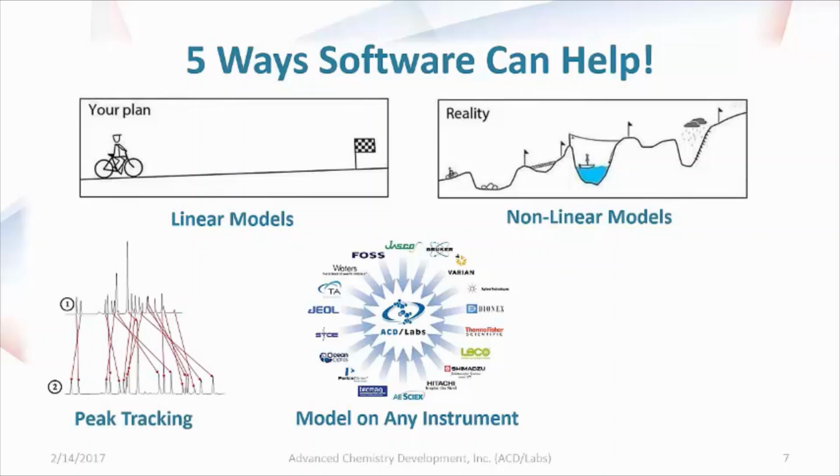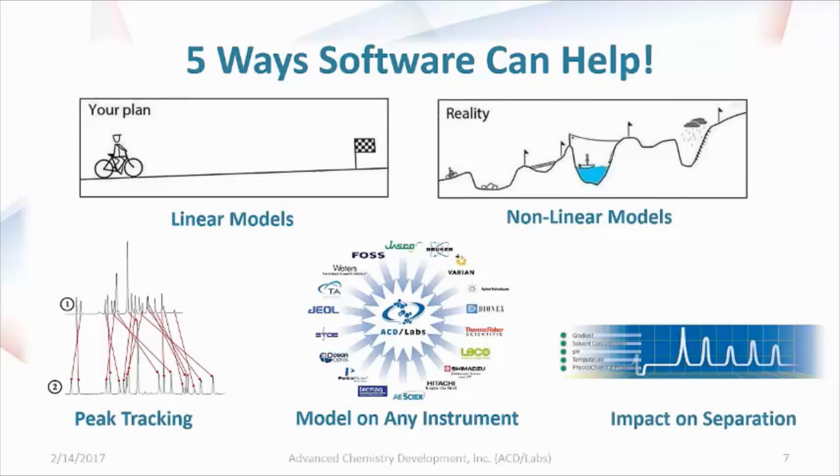There are some handy built-in tools to help with preparation of data, the main one being peak tracking. So as you're doing method development and you're changing parameters, peaks can move relative to one another. So there are tools built into the software to automatically track the peaks between experiments. And finally, there are tools within the software to allow you to optimize particular parameters to meet the suitability criteria that you define for your separation, such as gradient, pH, temperature, and solvent concentrations.